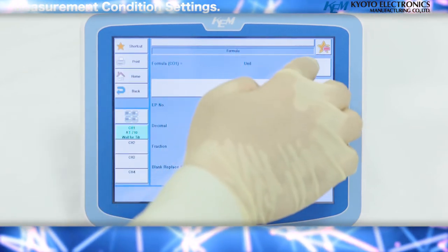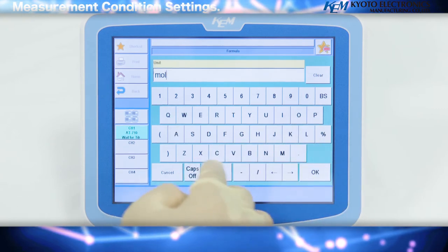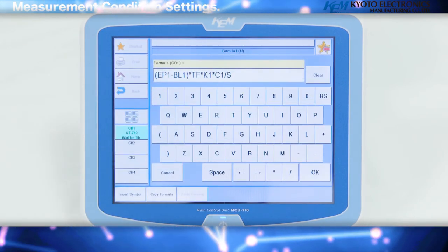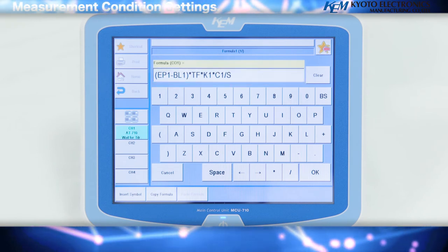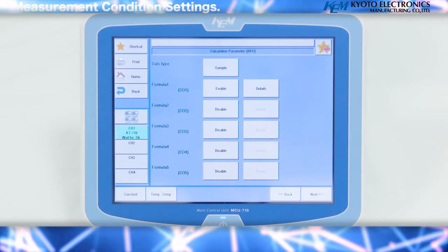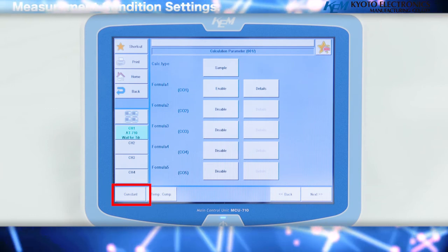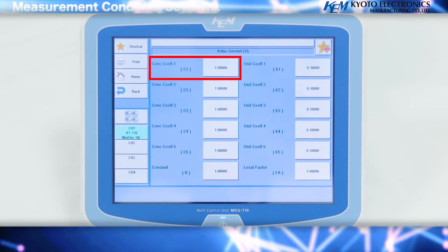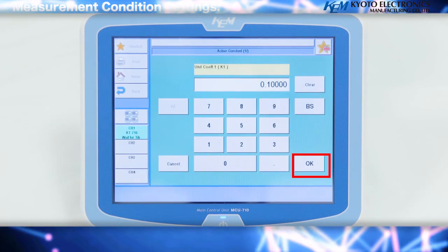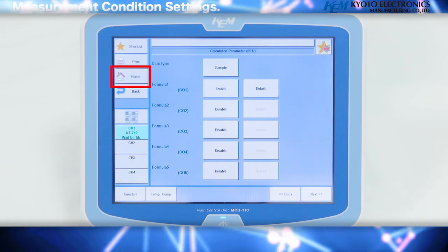Press the back key, then the calculation parameter key. This time we will perform a titration using calculation formula 1. Confirm that it is valid and press the details key. Enter the units — for this case, select mole per liter and press OK. The unit of concentration is decided by the selection. Depending on the acid being used, you must select a constant. Press the constant key, select concentration coefficient 1, and press OK. Press the back key to return to the previous screen. When all settings have been made, press the home key.